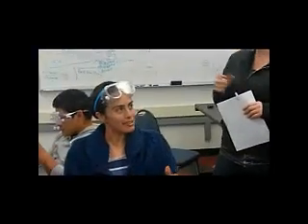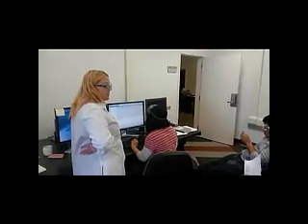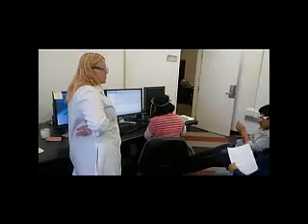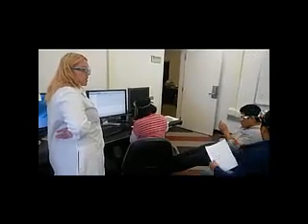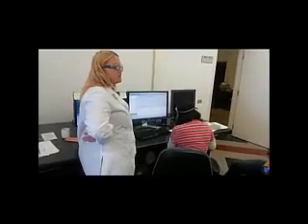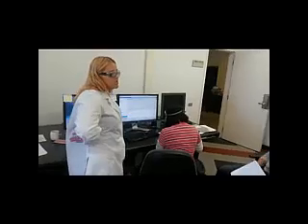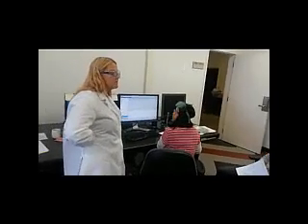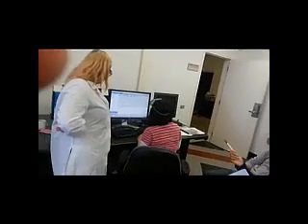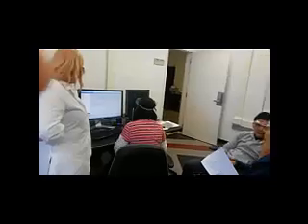To get your graphs, do you save it to the computer and email it? To get your HPLC graphs, you can save them to either the desktop or your flash drive as a PDF, and I can show you how to do that. For the Excalibur, the only way I know of to get the MS data is print screen, a snapshot of it. Excalibur is specifically for MS, whereas ChemStation is for HPLC.